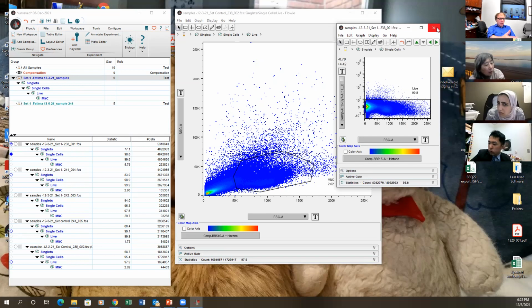Well, yes. When you are doing the sorting, you just do the analysis. When you collect the event, you just collect. Actually, what I did is, before you start collecting events, you already set it up so you collect this only. Got it. It's the non-bead corner. Right. So we're going to go from the beginning, before I start recording. But luckily you have 5 million, 3 million. Otherwise we'd have almost nothing left.